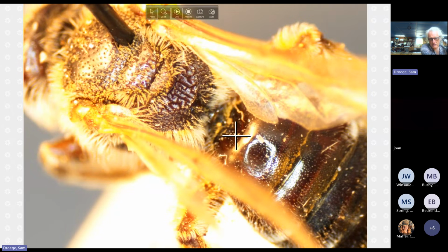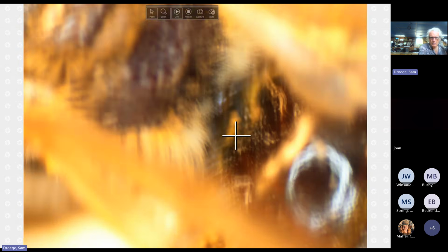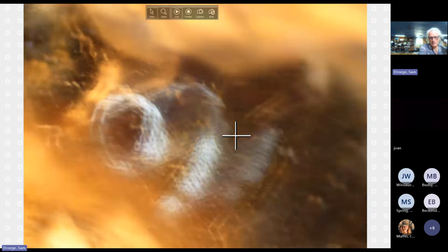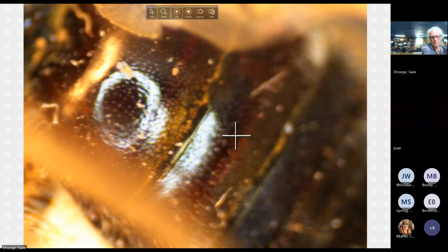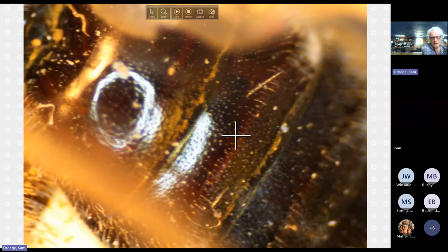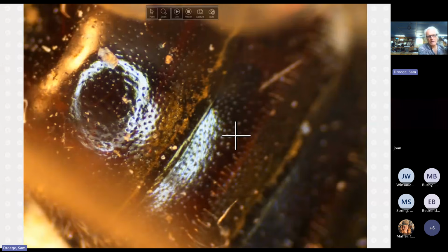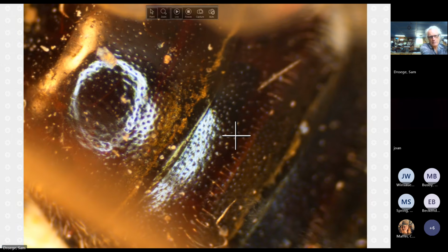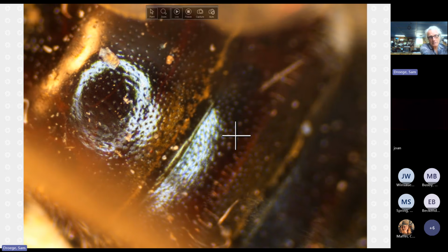And I think the answer lies in that, but obviously not the case in that first one, that Miranda one that we saw, that I would have chosen a set of yellow markers, things that if you saw that combination, that would equal a species ID. So I think that's largely the case, but maybe not necessarily, and obviously not always. But I think that's the general idea.